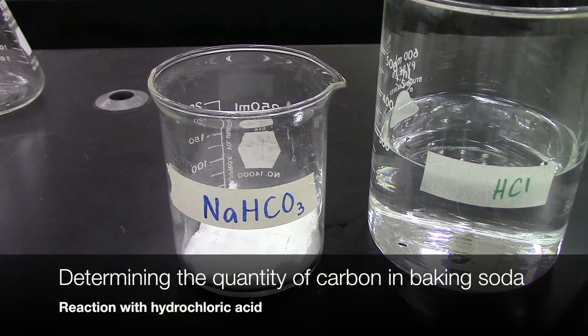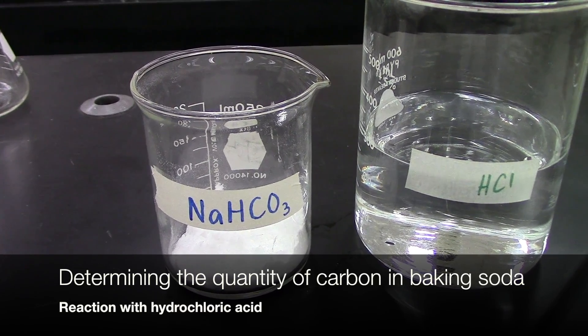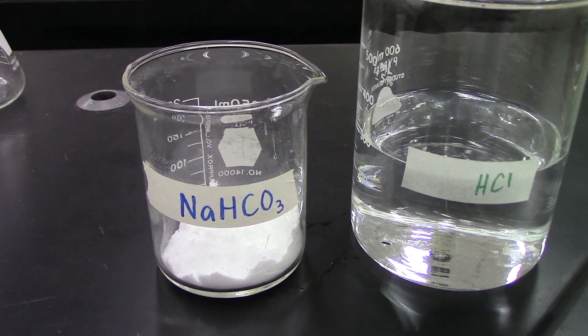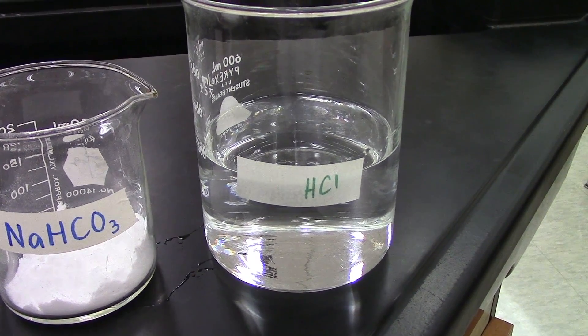Welcome to the third lab in the mole quantity series. This time we are going to work out the mass of carbon in a particular sample of baking soda, which is sodium hydrogen carbonate. We're going to do that by reacting it with a hydrochloric acid solution.